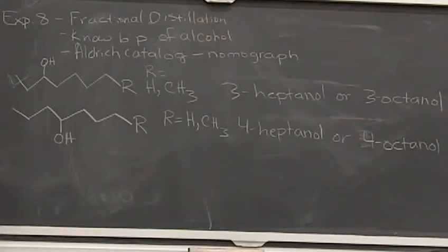So you don't need to be taking fractions all the way up to 130 or 150, depending on what your alcohol is. You just need to worry about that 10 to 20 degree range around your alcohol, okay? And usually below it.